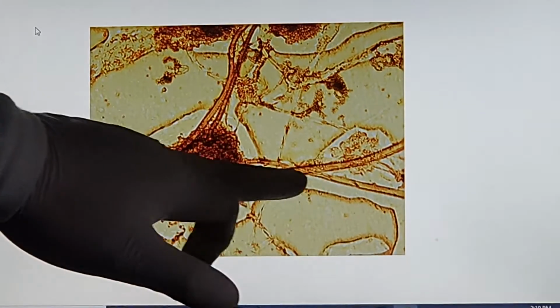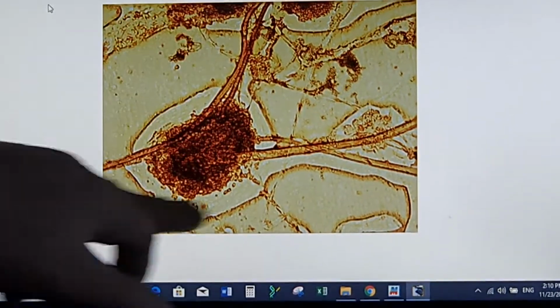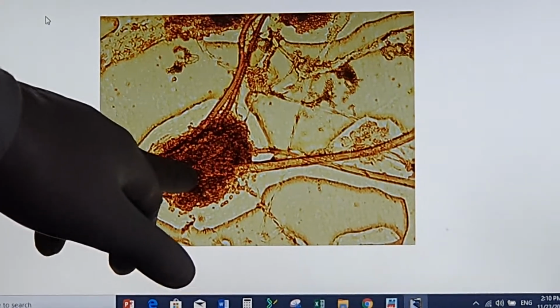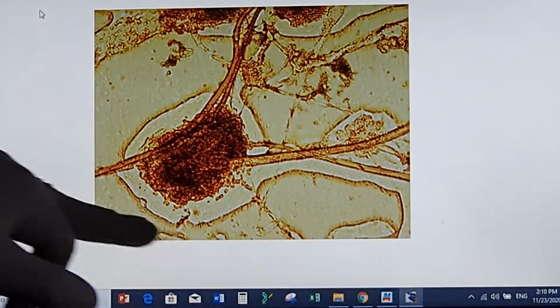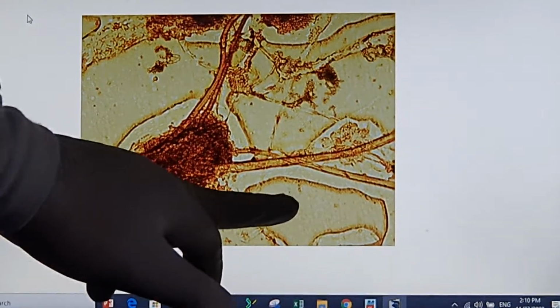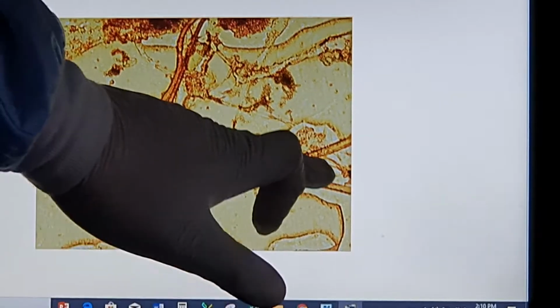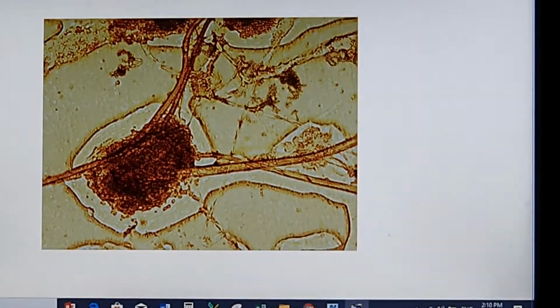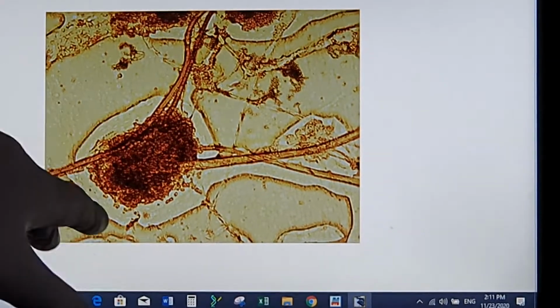And the hyphae leading towards the fruiting body is what provides the spores, right? So spores bud off the hyphae and collect in this sac, right? And then they are clones of the mother hyphae, and they are asexual spores, right? Note that in this zygomycete, the hyphae is aseptate, so there are no sections between the hyphae. So you want to make notes like that, right?